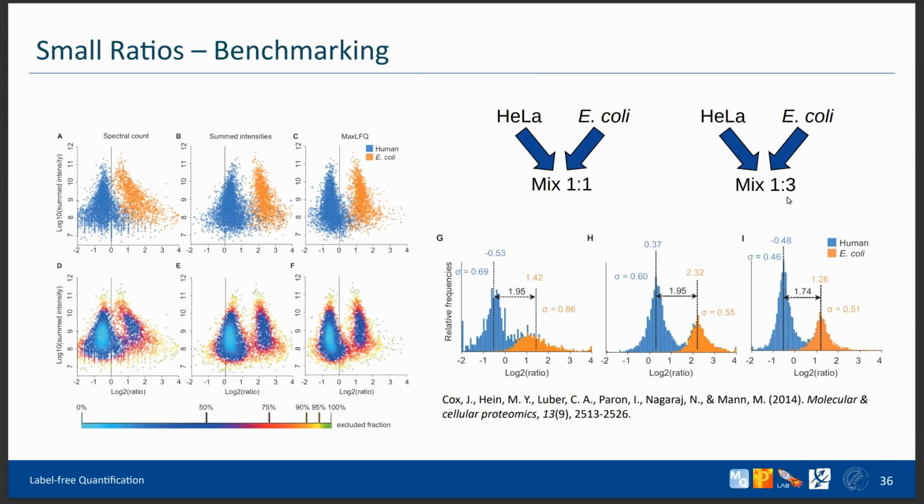What you do is put all these proteins together into a mixture, sequence them in the mass analyzer, and then through MaxQuant you tell the program that you have 2 different species, and compare the output that you get. You expect to find ratios between all the proteins that have been identified very similar to the initial ratio that you used in your sample.